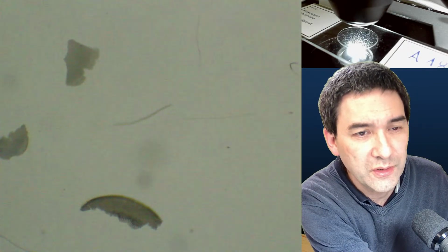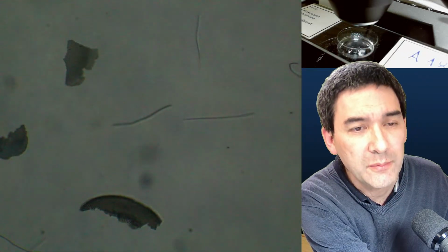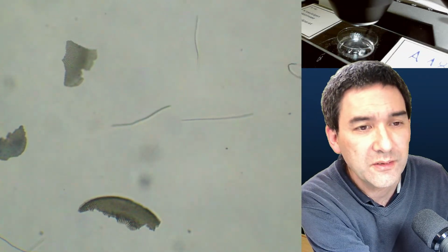Let me show you those. Again, that's completely without filter. Let's close the diaphragm here to increase the contrast.